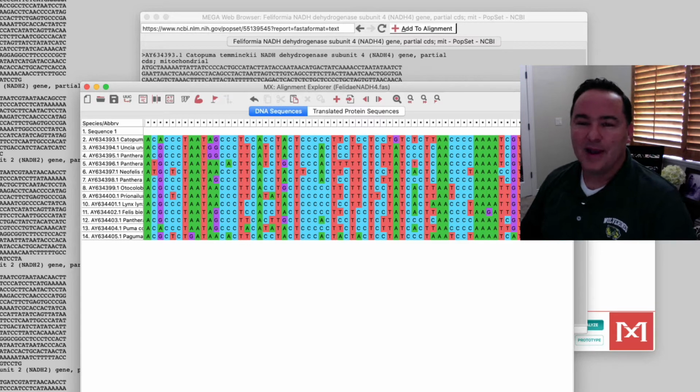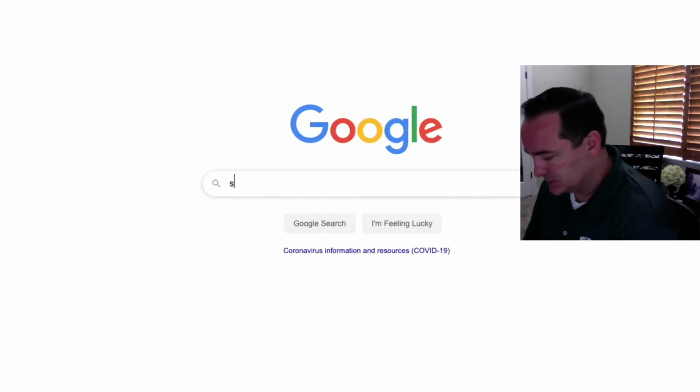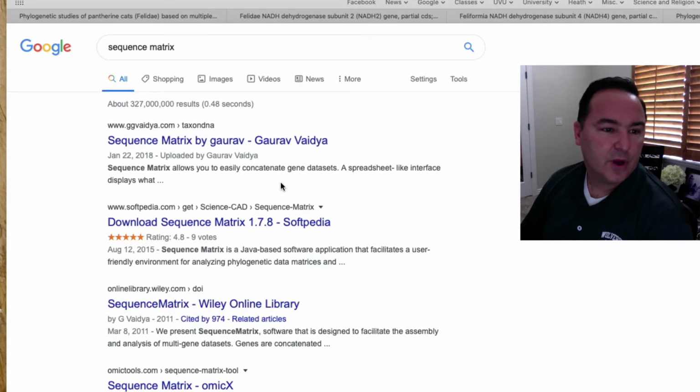But there is one, and the program that I like to use, I'm going to open up a new window here, is called Sequence Matrix. Sequence Matrix. And if you go to, I think it's this link.